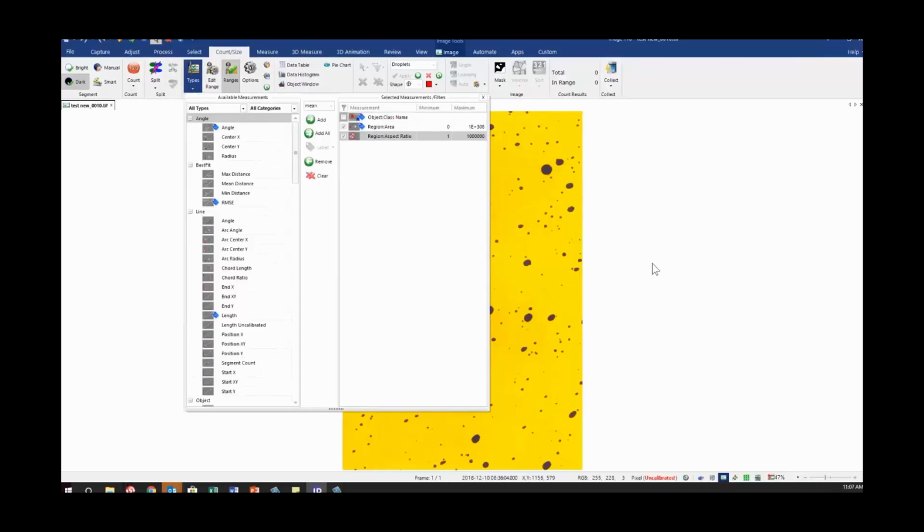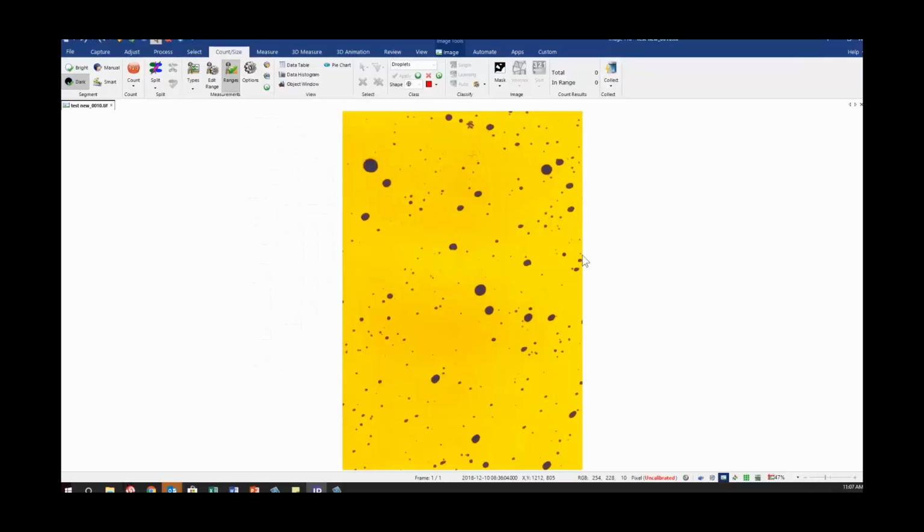The sample here is wetting paper that you can put out in a field, and if someone's doing an aerial spray, the droplets that land will hit the wetting paper, and they can actually look at a distribution analysis. We'll put out these papers, or if you're doing some other type of spraying operation, this is a way of looking at how well the distribution is occurring, or how well the dispersal of any type of agricultural product, in this case, is being spread.